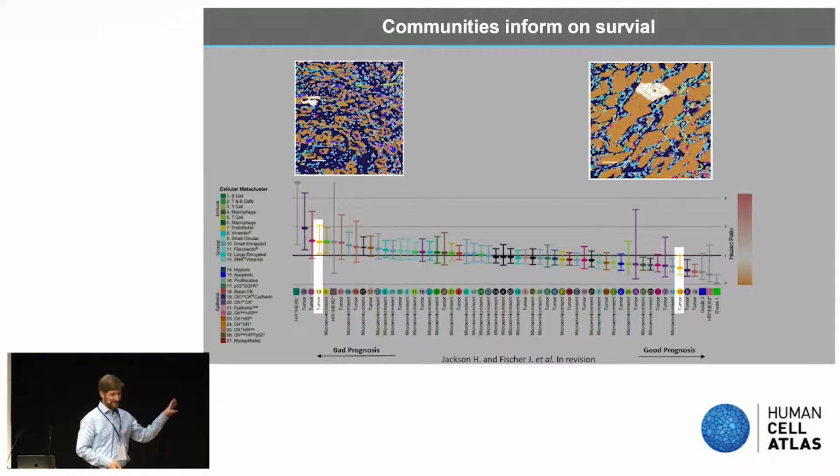But what I want to stress here is that this is only based on the tumor cell communities, and they're fairly homogeneous. Even though patients are very heterogeneous in tumor cell content, we found that communities are fairly pure with respect to tumor cell content. Rather, you will have in one patient different communities with different phenotypes, but each community contains mainly one phenotype.